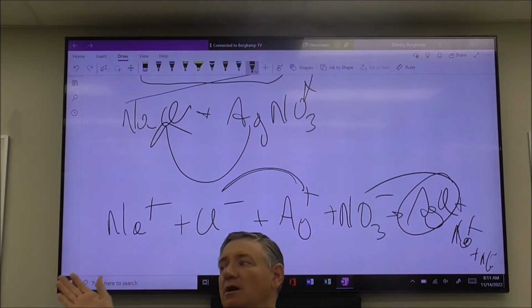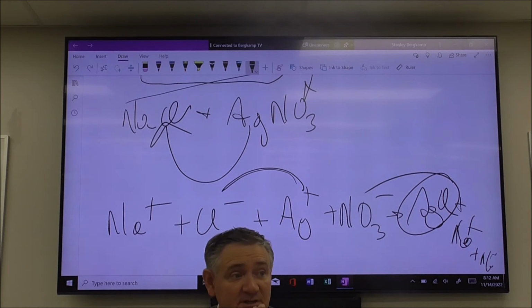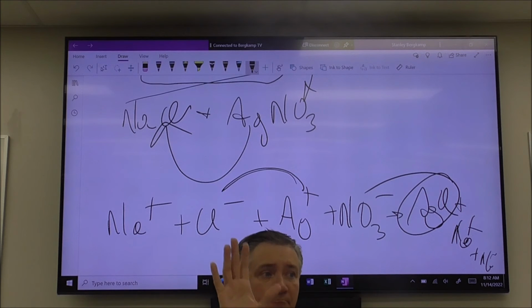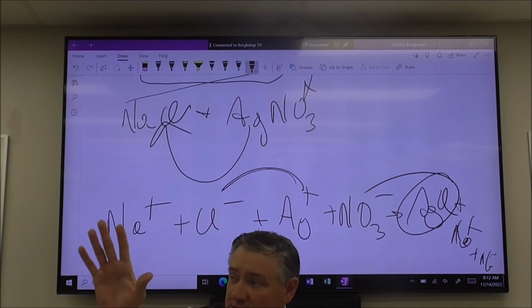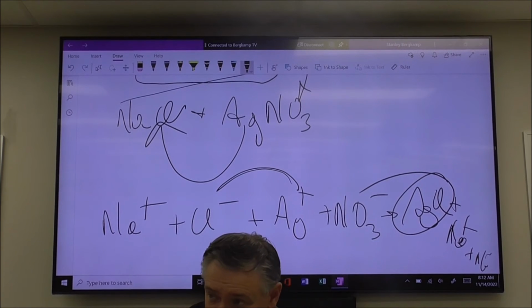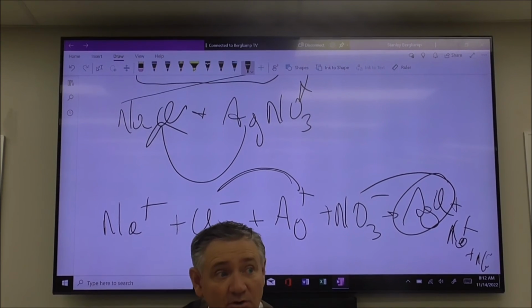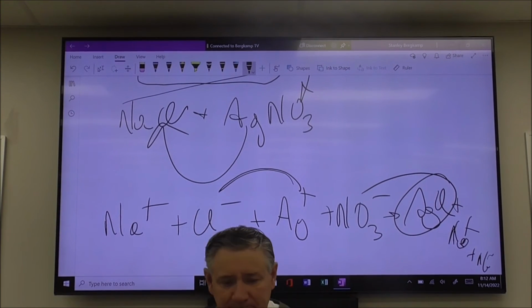Okay, so we've got to get over there, work efficiently. Focus on getting the lab itself done. Make observations. What's going on? Make sure that you are wearing safety glasses because a lot of this stuff is fairly nasty. So make sure at all times that you are wearing the safety glasses. Let's go.